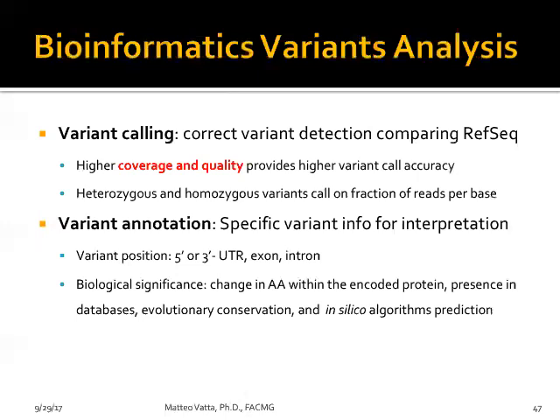With longer reads you have to sacrifice the coverage, but you have a much better quality in terms of detection of longer reads and differentiating between the real target and pseudogene targets or other targets. So that's why you usually go with the longer reads in order to be more specific when you map to the reference genome. That's usually has been the case.